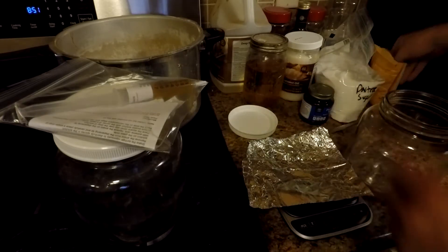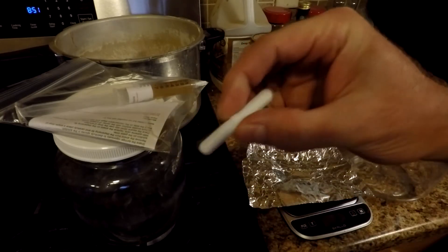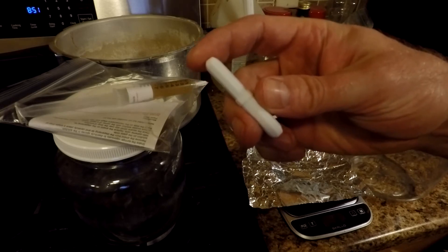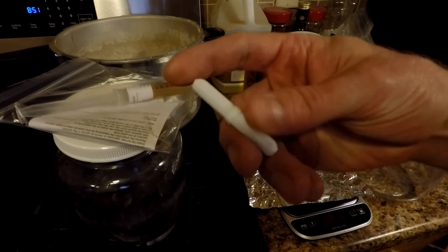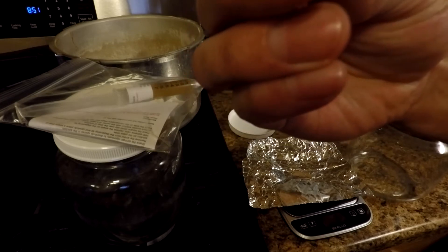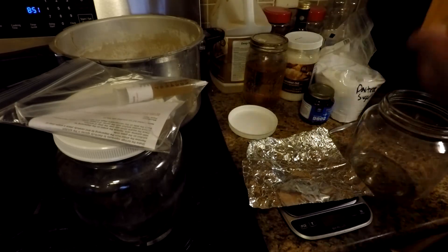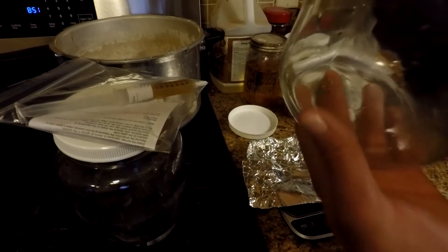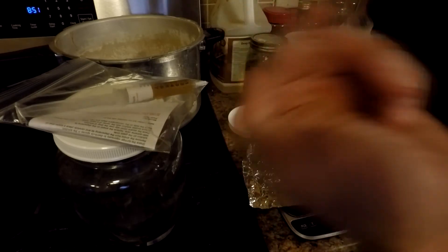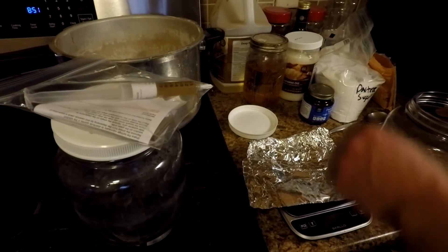Inside each jar I have a magnetic stirrer bar — this one is about one and a half to two inches, octagonal in shape. What that does is when I put the jars on my stirring plate, the spinning magnet catches the bar and spins it around, mixing everything inside. That way you don't have to shake the jar and slosh the mixture up onto the lid. It makes things way easier.